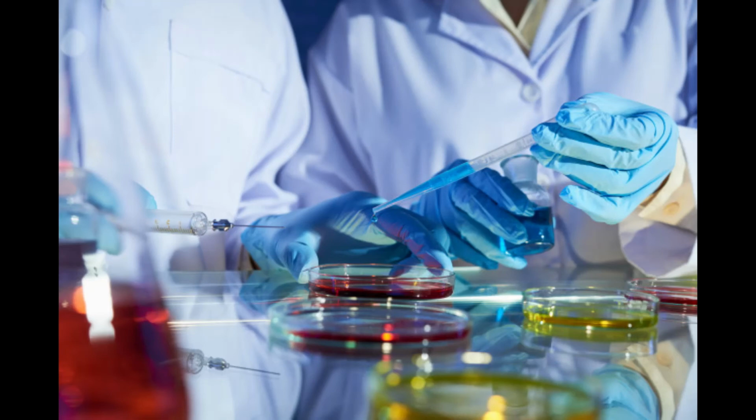But if you do a streak plate and you dilute the sample out as you streak, then you can isolate individual microbes. And so what that looks like is, if this is our nutrient agar plate, so that's what we'll do the streak plate on. You have to visualize that there's 4 quadrants. So you don't draw 4 quadrants, you don't draw a big plus sign here. But you gotta visualize that there's 1. You're gonna dip, let me back up. For this one, you're gonna use the disposable yellow loops out of the drawer. The disposable loops out of the drawer.